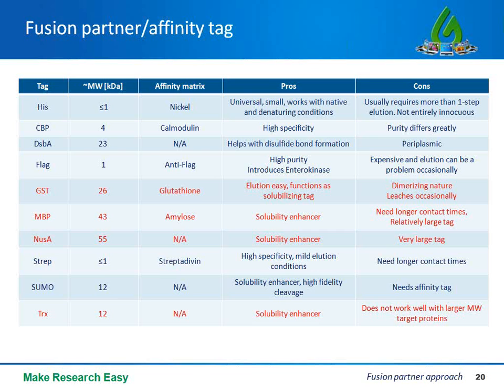So about the His tag. As you know, the His tag is quite universally used as an affinity purification tag, but just remember that the His tag is not as innocuous as some would think. It can affect expression levels, protein solubility, its bioactivity, stability, and even the structure and overall function of your protein. Sometimes, not always. CBP is short for calmodulin binding peptide. It's a really short affinity tag that uses immobilized calmodulin Sepharose for affinity purification.